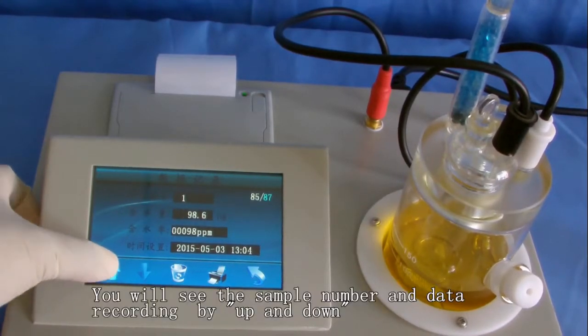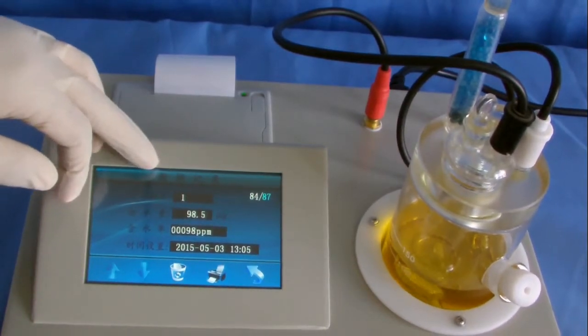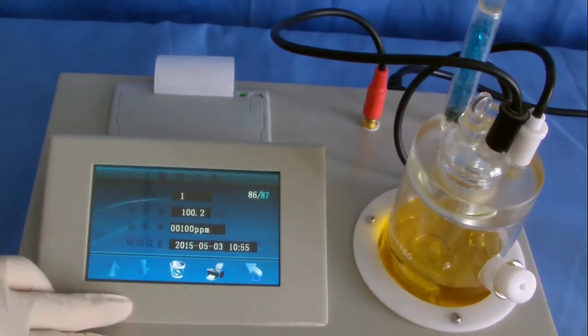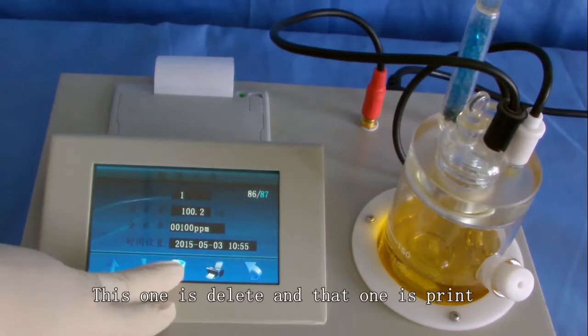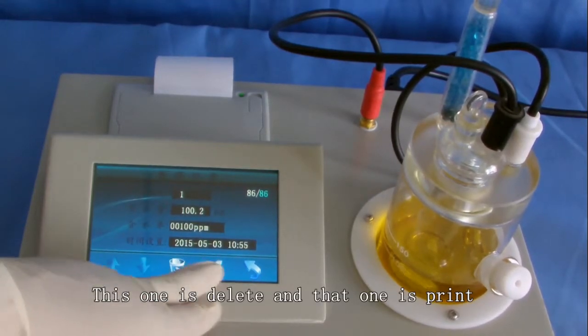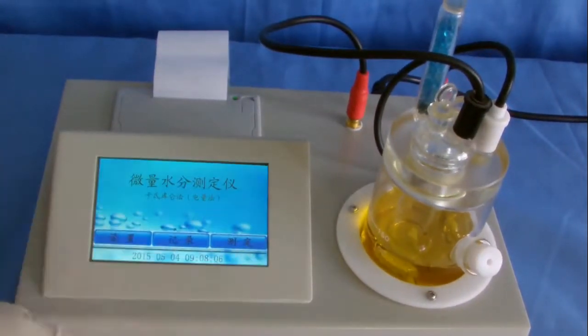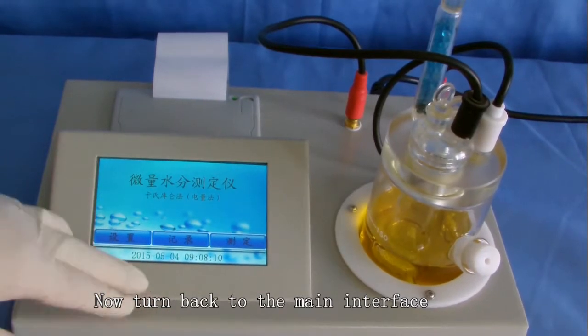You'll see sample number and data recording by up and down. This one is deleted and that one is print. Now, turn back to the main interface.